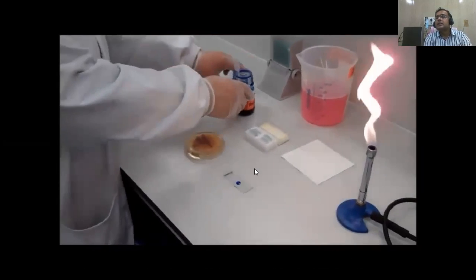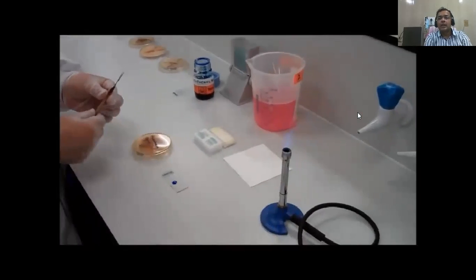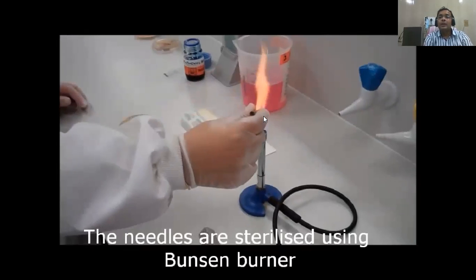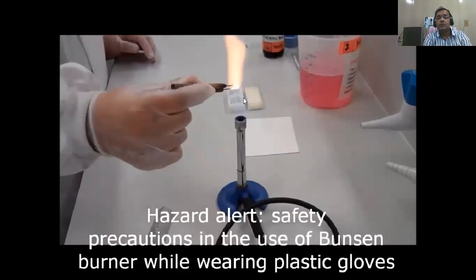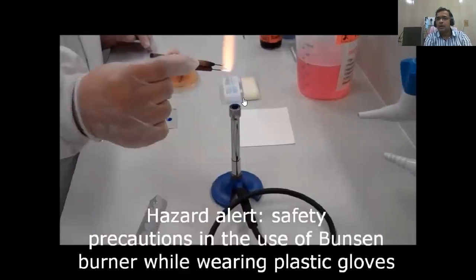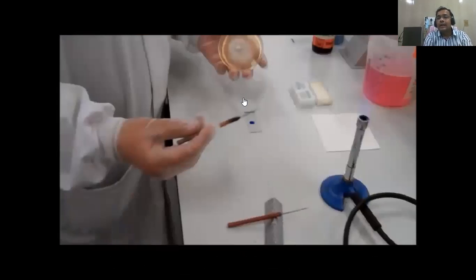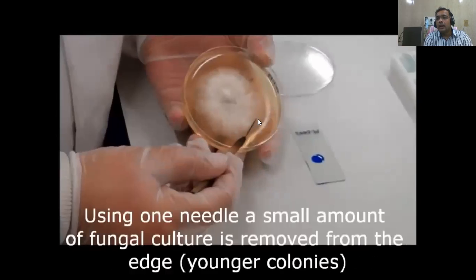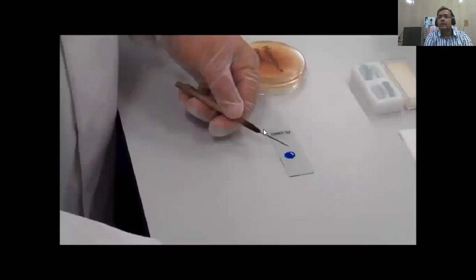Now, after keeping this drop of lactophenol cotton blue, you have to take the fungal culture. To take it, you have to sterilize your needle. Here, a platinum loop may not help because the growth is very hard to take up from the agar. So you have to sterilize that needle over the Bunsen burner and allow it to cool. Once it cools, take the fungus culture from the edge of your fungal growth, because there are younger colonies that can easily take up your stain.